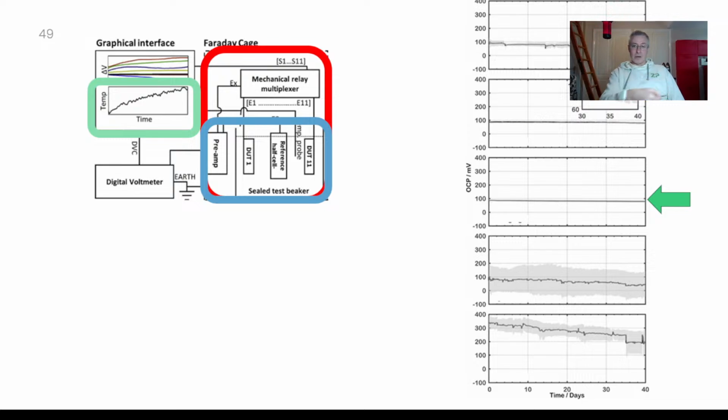It's not something that we test for. What we do is we make a screen printed electrode that we test the repeatability on, because we expect people to use them in a point of need diagnostic. By the way, we do use them in continuous work. In fact, this is 40 days worth of work, but it's quite a rare occurrence for us, and you will very, very rarely actually hear me even talking about it.